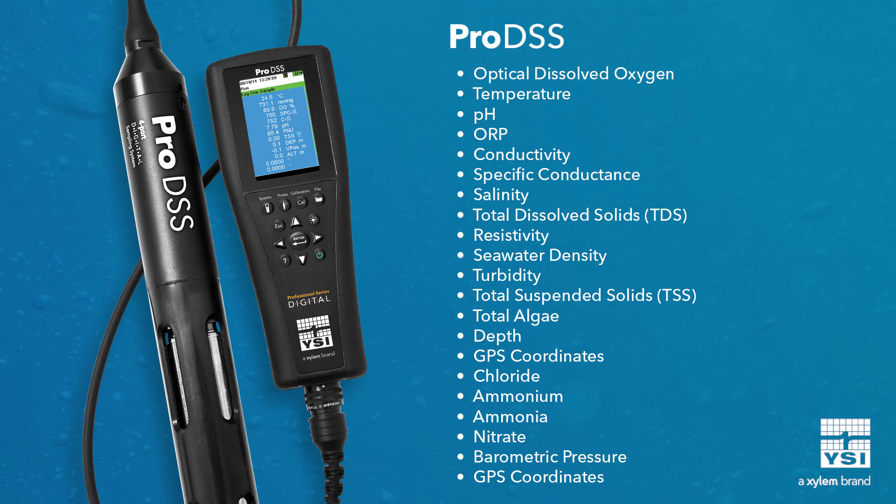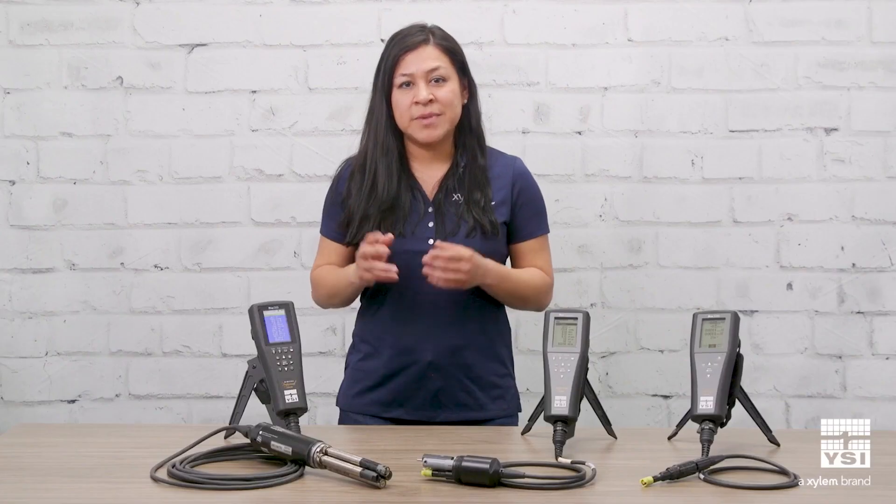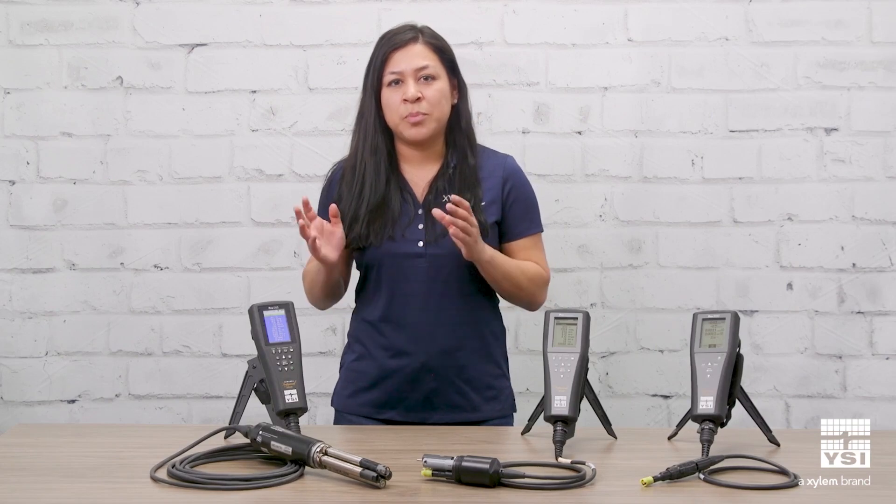The ProDSS brings added versatility and customization with a 4-port cable that allows for any combination of 4 sensors at once, including optical DO, pH, ORP, conductivity, turbidity, and total algae. This makes the ProDSS the ultimate portable meter for customers looking for versatile parameter options in addition to optical DO.